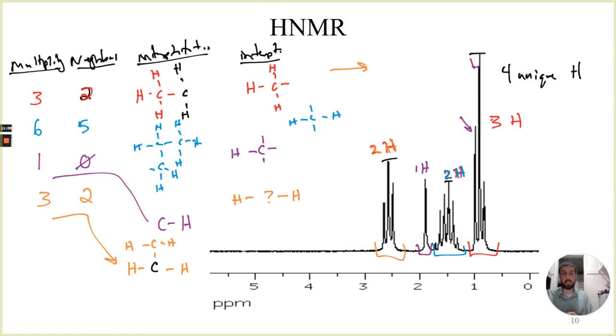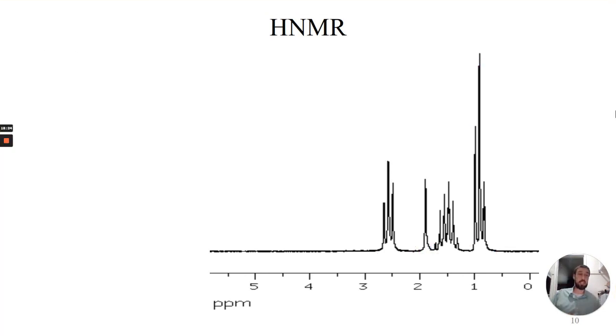Okay? With that, I'm going to go ahead and say we're done. We've done the fast walkthrough on this. You should go back through and practice these and see if you can pick up some of that speed. We did all of those spectra in about 10 minutes. Okay? And that's with showing all that work and writing that down. And we had about 4 minutes in between of just delay time.